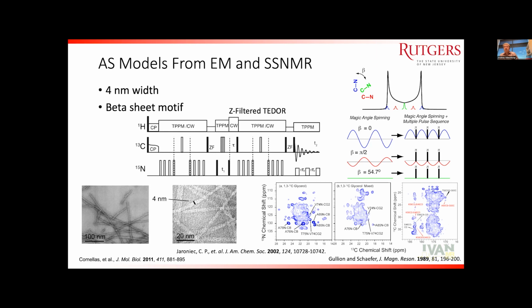And so that's something we're taking advantage of a lot, whereby NMR can help you with the fine details, the chemistry. You want to be sure that those side chains are actually where you think they are. You have something like an AlphaFold structure that'll get the backbone right 999 times out of 1,000. But does it have the active site right necessarily? And so then you can go in and use the dynamics experiments Ronnie talked about, the precise distances, and actually nail down the details of what's happening chemistry-wise on top of a structure that was solved using a method that's easier than solid state NMR is.